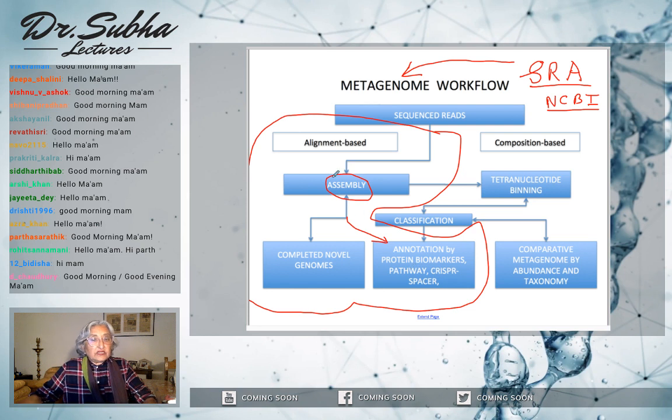Other things you can look for in this first pass assembly is CRISPR spacer. CRISPR spacer, you've heard about it, I've heard about it, everybody has heard about Cas9, right? But in the lab you will do this. You will take an already assembled file that I have. You can use that to find out CRISPR spacers, how they are put within the microbial genome. They repeat so beautifully, amazing. We have found 27 CRISPRs repeating with the spacers. You can see the CRISPR is repeating nicely 27 times, and the spacer sequences are different, of course. That really explains what you feel for CRISPR-Cas when you do these kinds of alignments. It was a very simple BLAST with the CRISPR and spacer database that you have to do. Those things you will do.